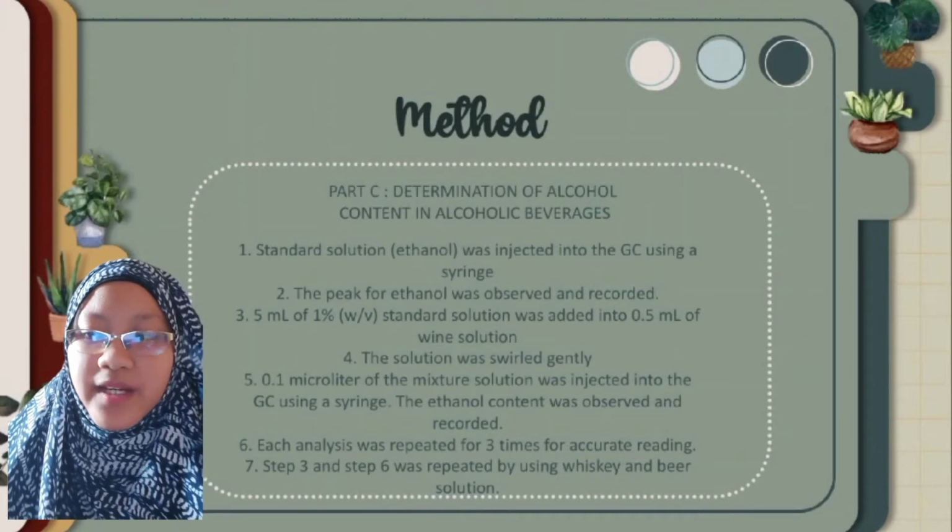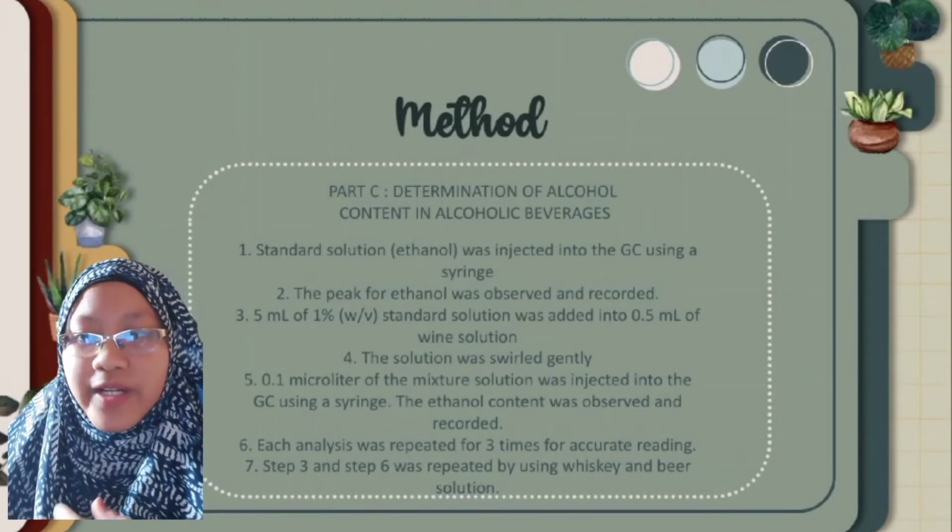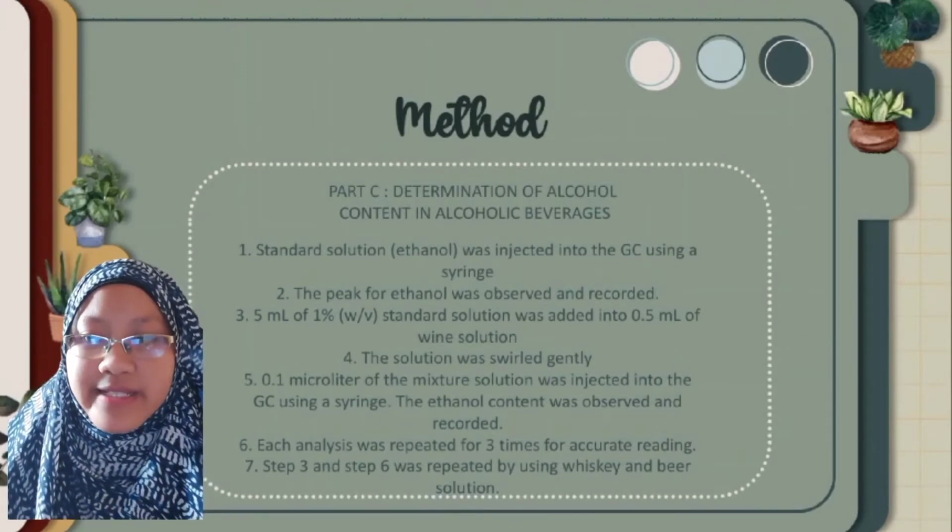observed and recorded. Each analysis was repeated 3 times for accurate reading, and step 3 and step 6 were repeated using whiskey and beer solution.